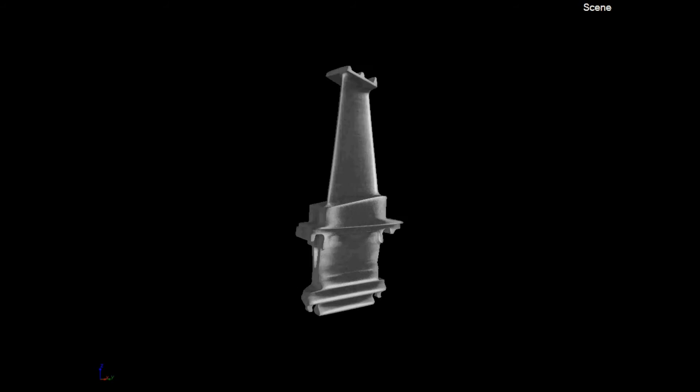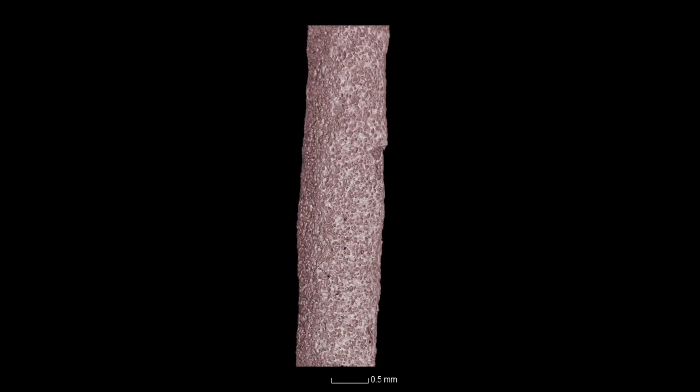Another example comes from the lab of Professor Monty Reichardt, who is using scans to resolve and characterize the 3D microstructure of porous drug-releasing polymer coatings. These sheaths could help devices in development monitor the blood sugar levels of diabetics in real time.